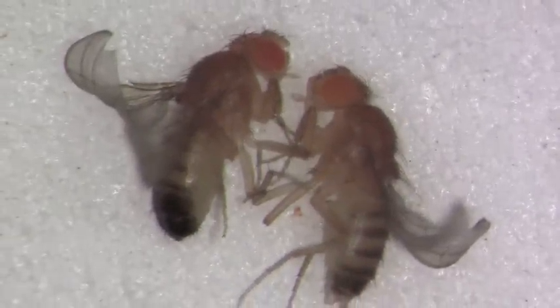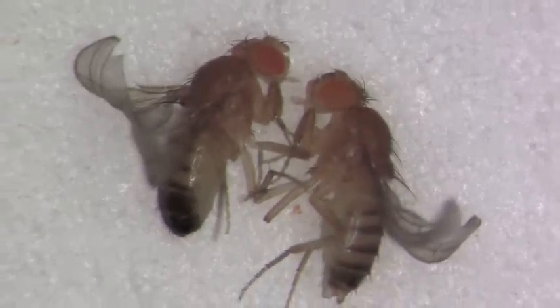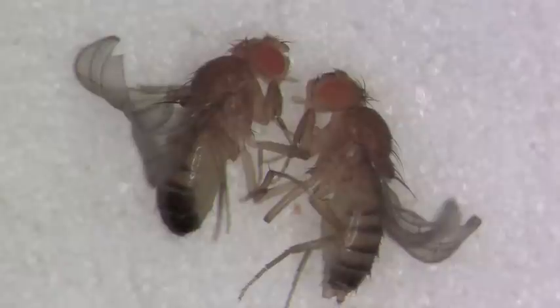These flies happen to have curly wings. Some of your flies will have curly wings, and some will have straight wings. For most of you, the eye color will be redder than these.